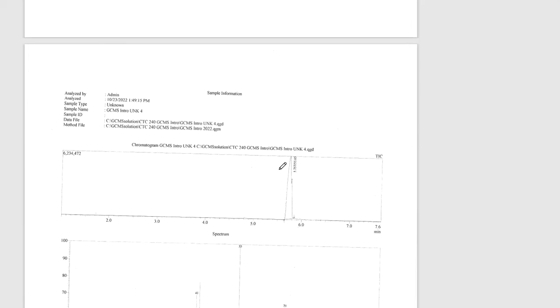Here's the spectrum from unknown number 4. Notice super tiny, no peaks really at all here. I see like the first major one here at 70. So do I have a compound with a formula weight that's close to 70? If it's way over 70, I'm going to cross those out. Those can't be a choice, right? If I've got a formula weight of 100, then that can't be a choice for this one. So I know I can just automatically eliminate it and narrow down my selection to figure out which one's which, okay? All right, so good luck on the match game.